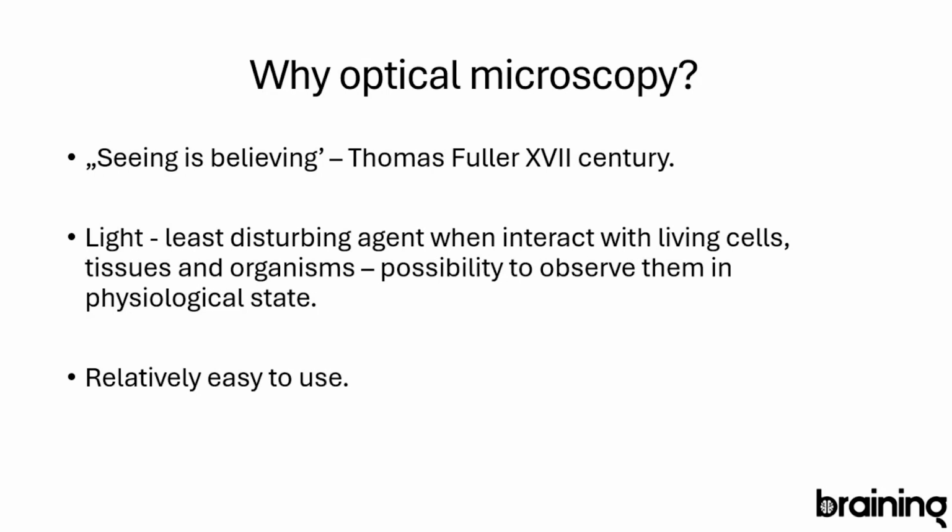The next aspect is that we are living in an environment which is filled with light. Usually we don't notice this, but we are surrounded by light always. So it looks like light is the least harmful agent which can interact with us, and this is a very important aspect of this method, because we can observe the biological system in almost physiological state without introducing too many disturbing factors.